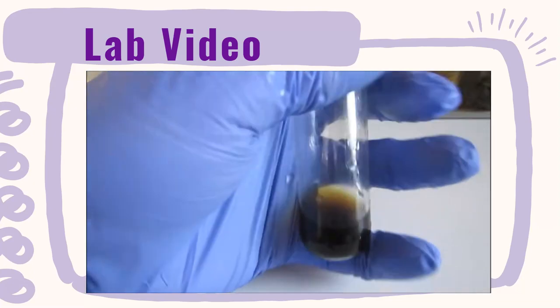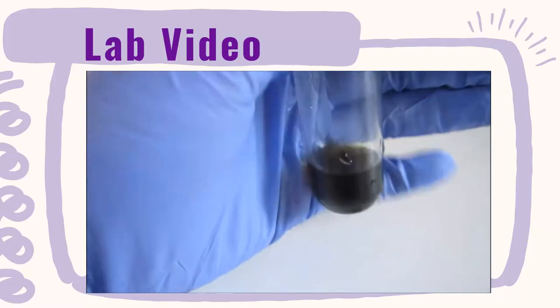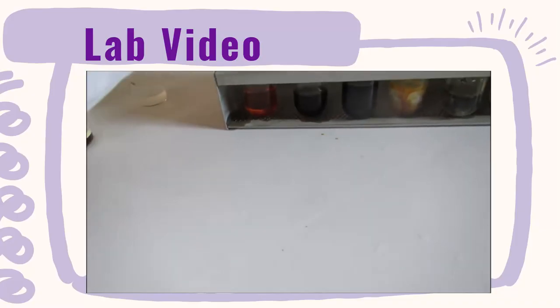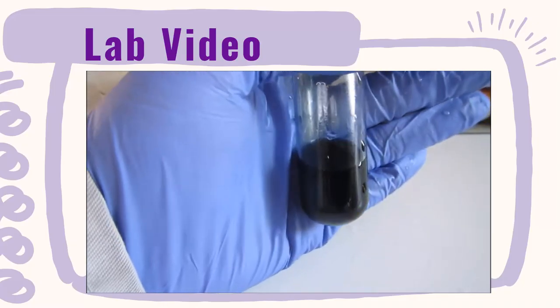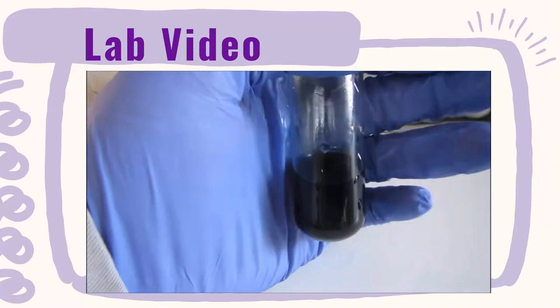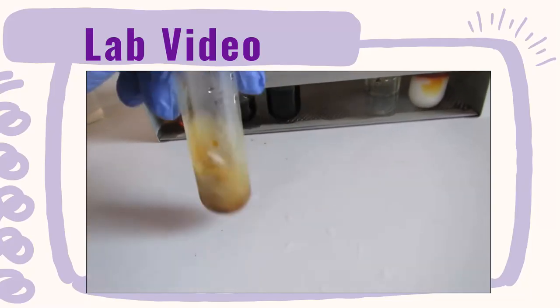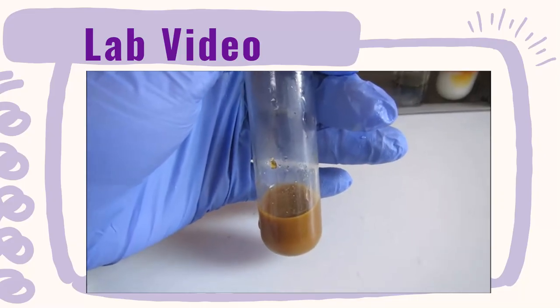Okay, so I've added some iodine to all of the tubes. In the first one, our deionized water, our negative control, it's remained much of a muchness in colour. Then our next one, the positive control, instead of that reddy brown, it's gone black, sometimes also said to be bluish black. So that's the colour we're looking for.